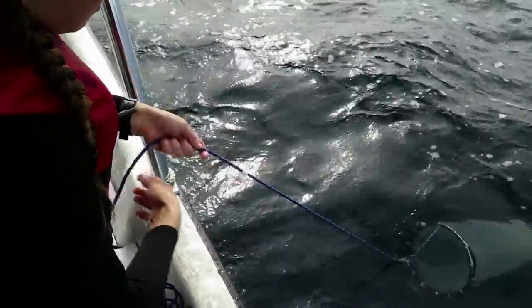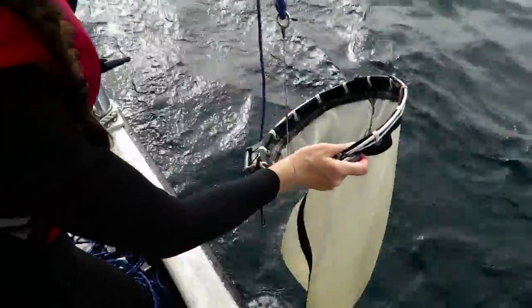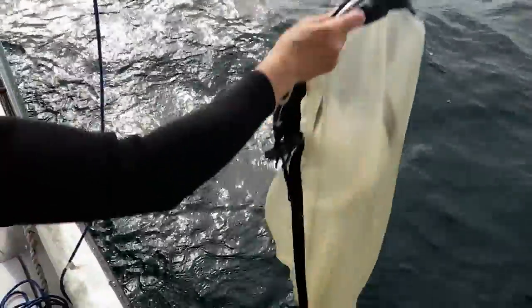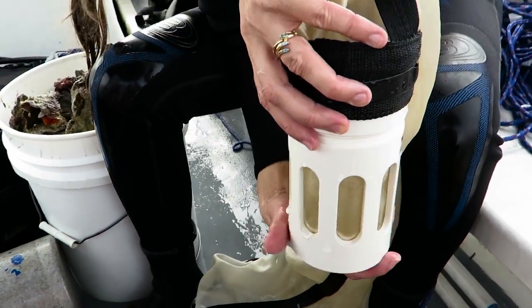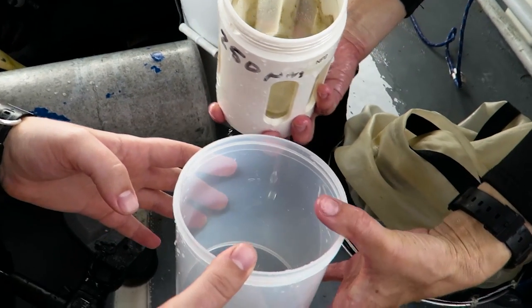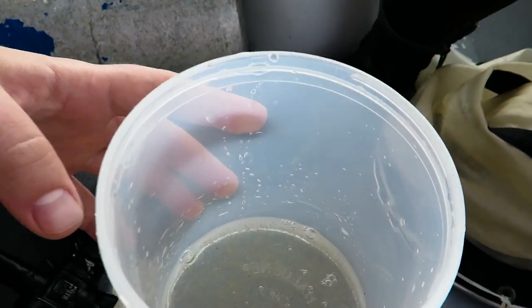Now we're pulling up the net. Raise it out of the water and dip it in a few times to rinse the plankton into the cod end. Unscrew the cod end or unclip it and pour the sample into a jar.